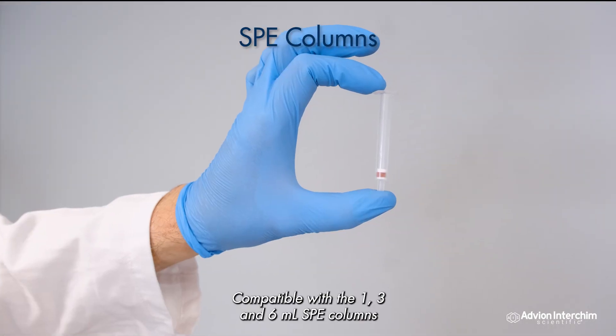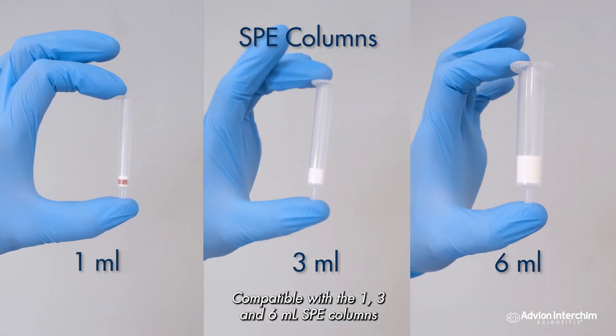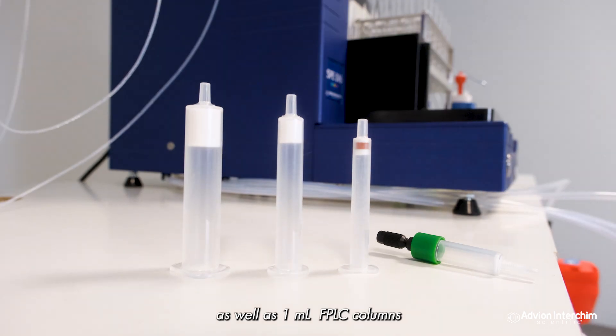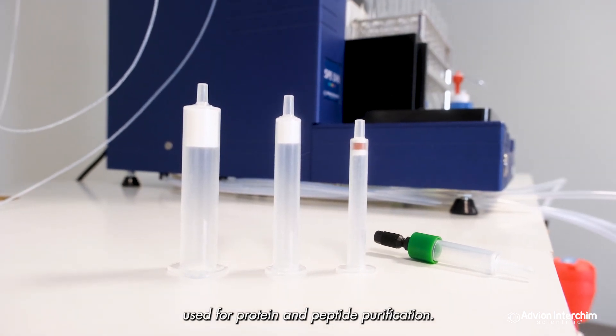Compatible with the 1, 3 and 6 milliliter SPE columns, as well as 1 milliliter FPLC columns used for protein and peptide purification.